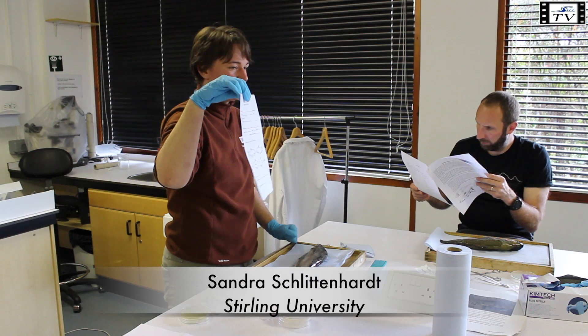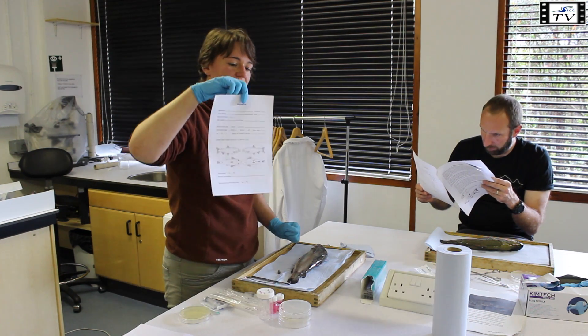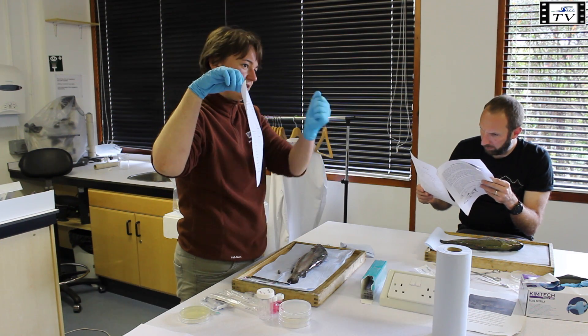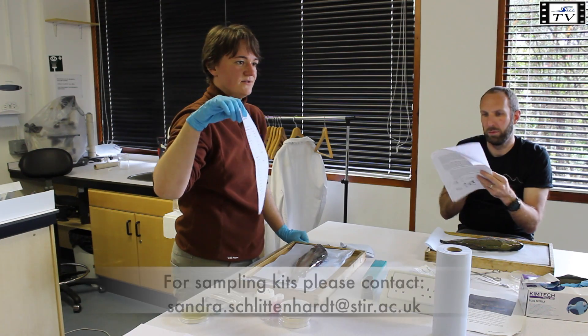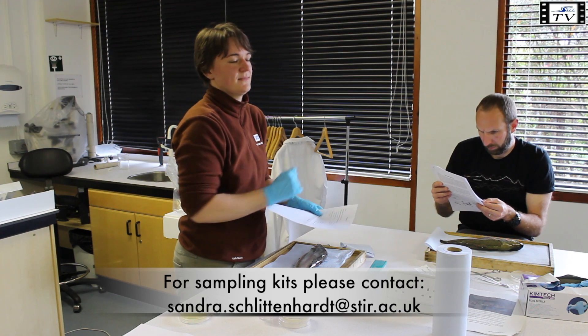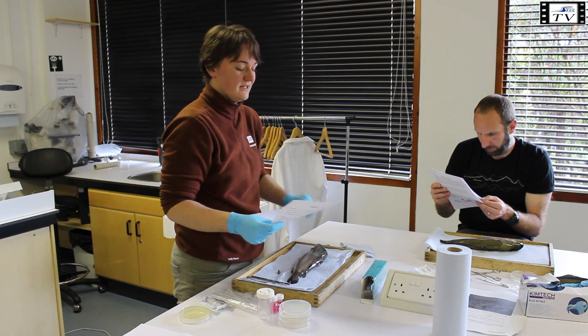You just write down what kind of page it was and where you took the samples, and on the back side, to make it very easy for you, there's just a checklist where you can tick everything as soon as you've done it. It's also in the order that you should take the samples, so you basically just have to run down the protocol and you're fine.